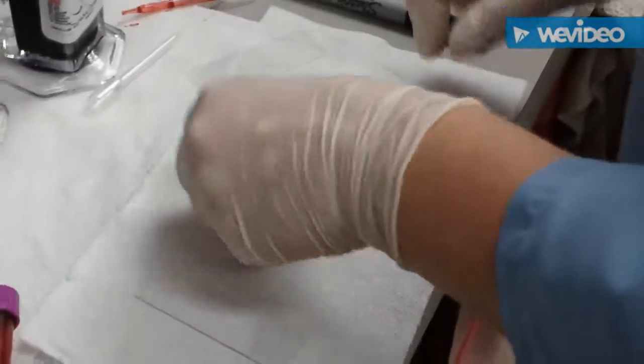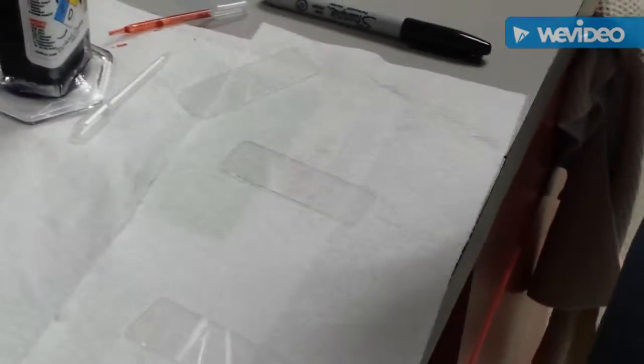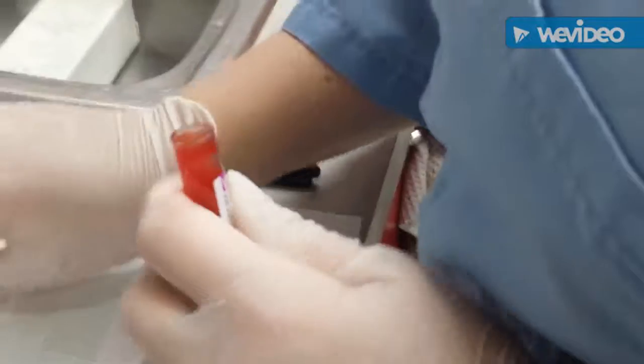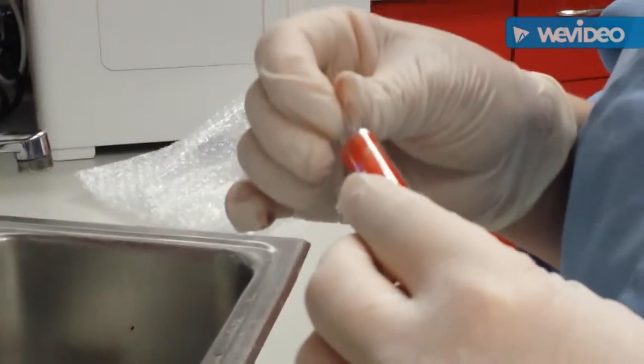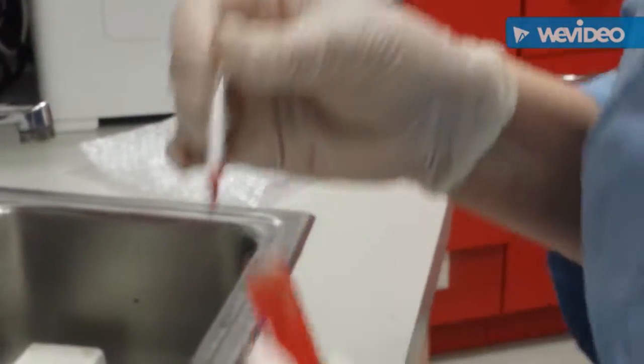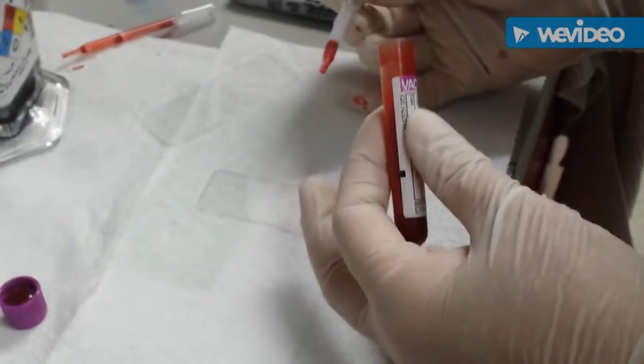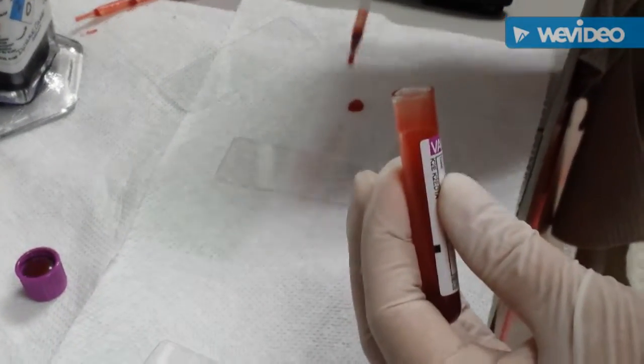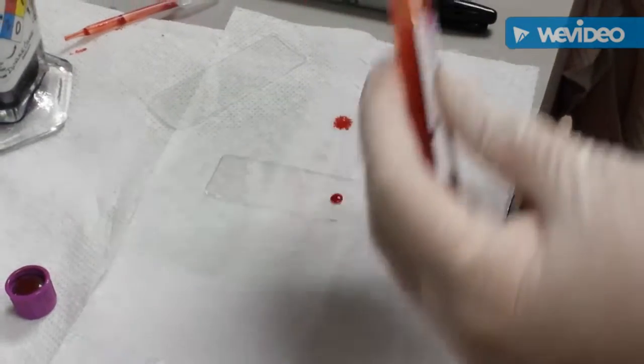So then we're going to go ahead and make our second slide. So we're going to invert our sample here, get a clean pipette, get just a tiny drop, place that onto our slide.